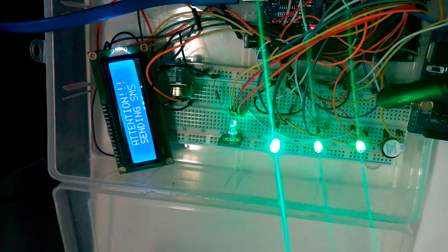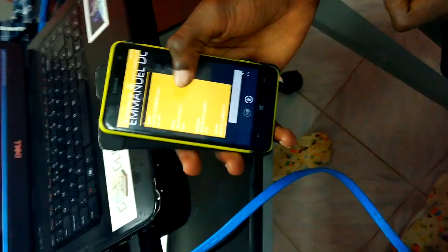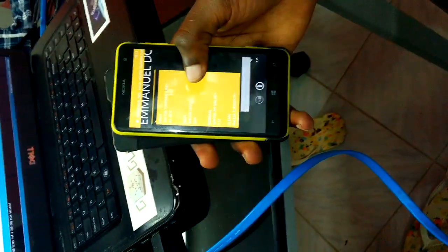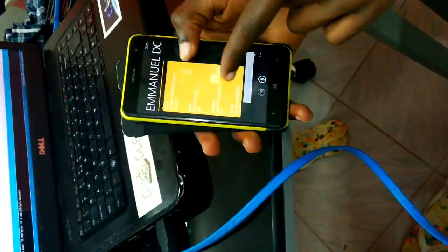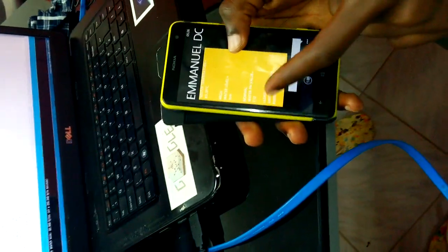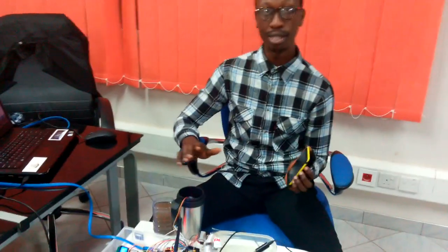We now have all green LEDs, and the SMS is being sent. We receive it — it says: high water temperature, the water level is still high, normal water pH value of 7.12, and clean water turbidity. This is just a helpful demonstration of the water quality test, and as you can see we have all parameters set and everything is now clean.